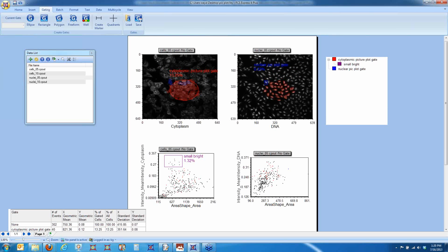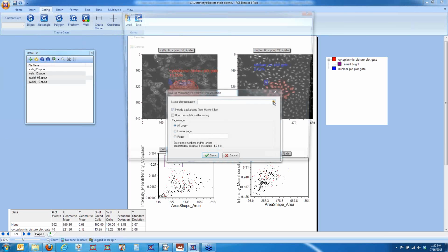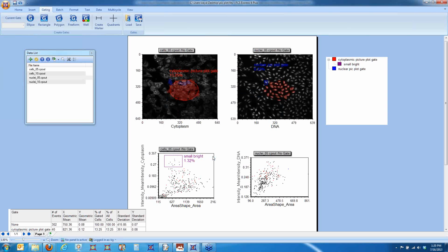Okay, so let's save this real quick as a PowerPoint. I'm just defining the path here. And this should open automatically.